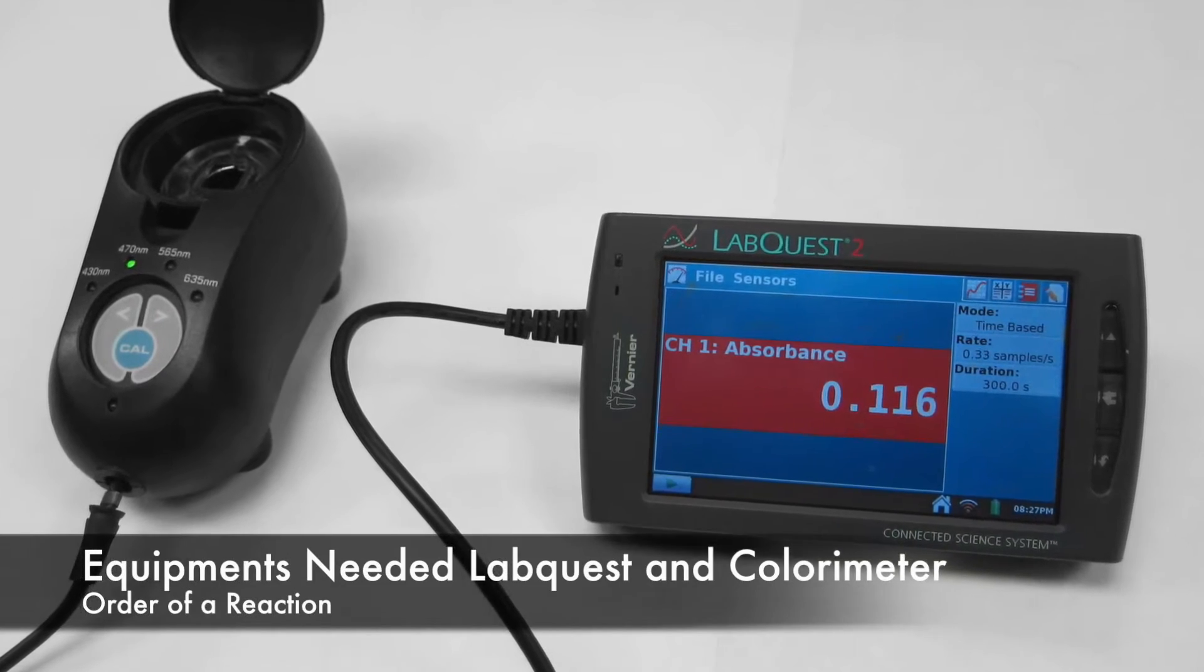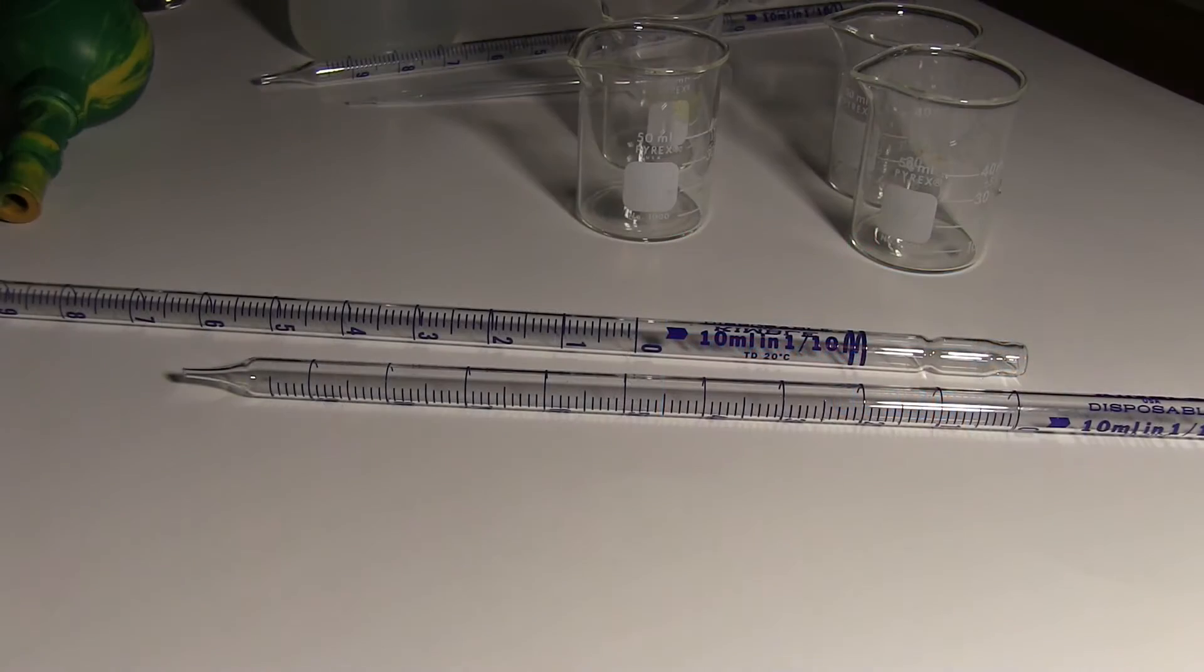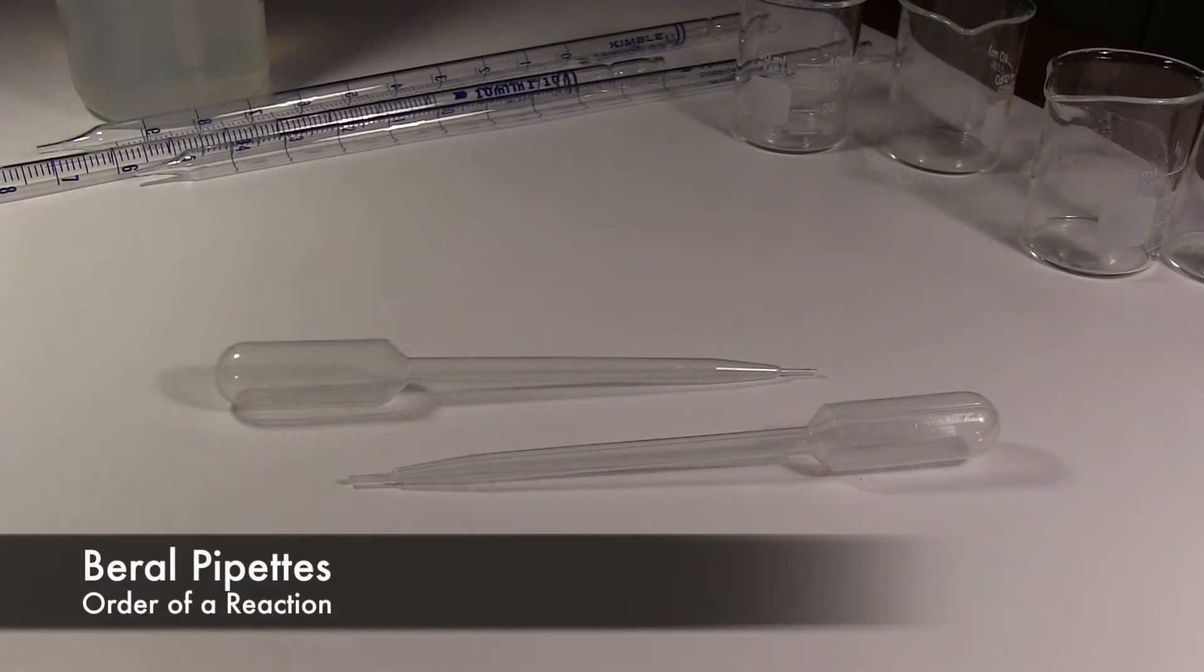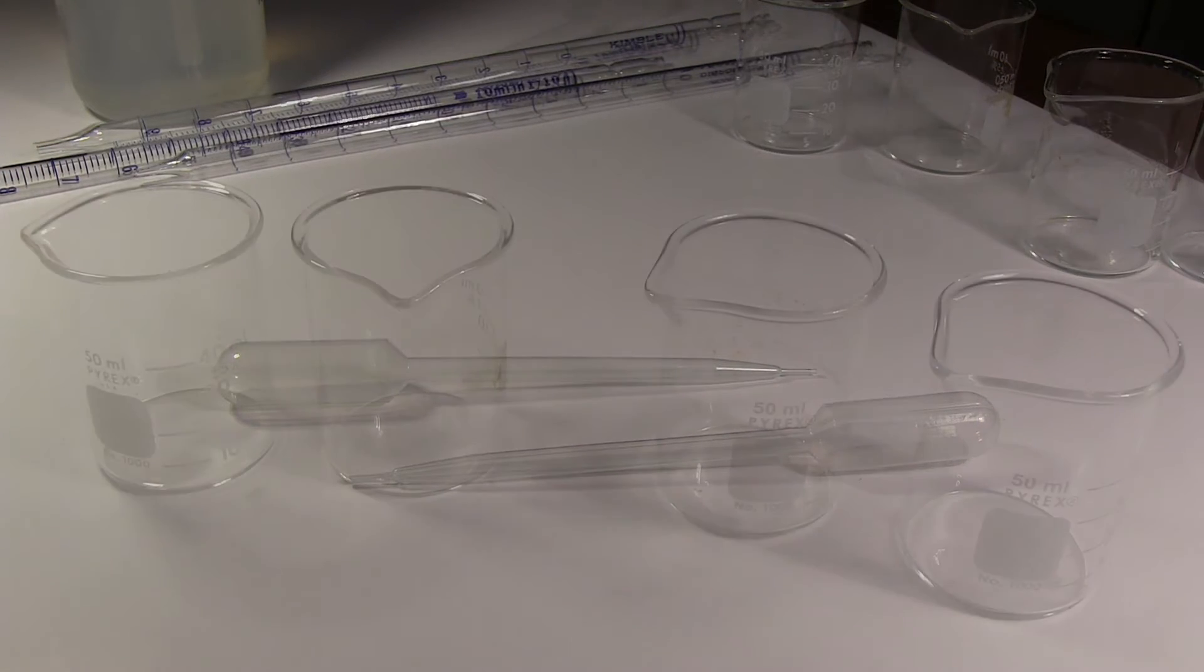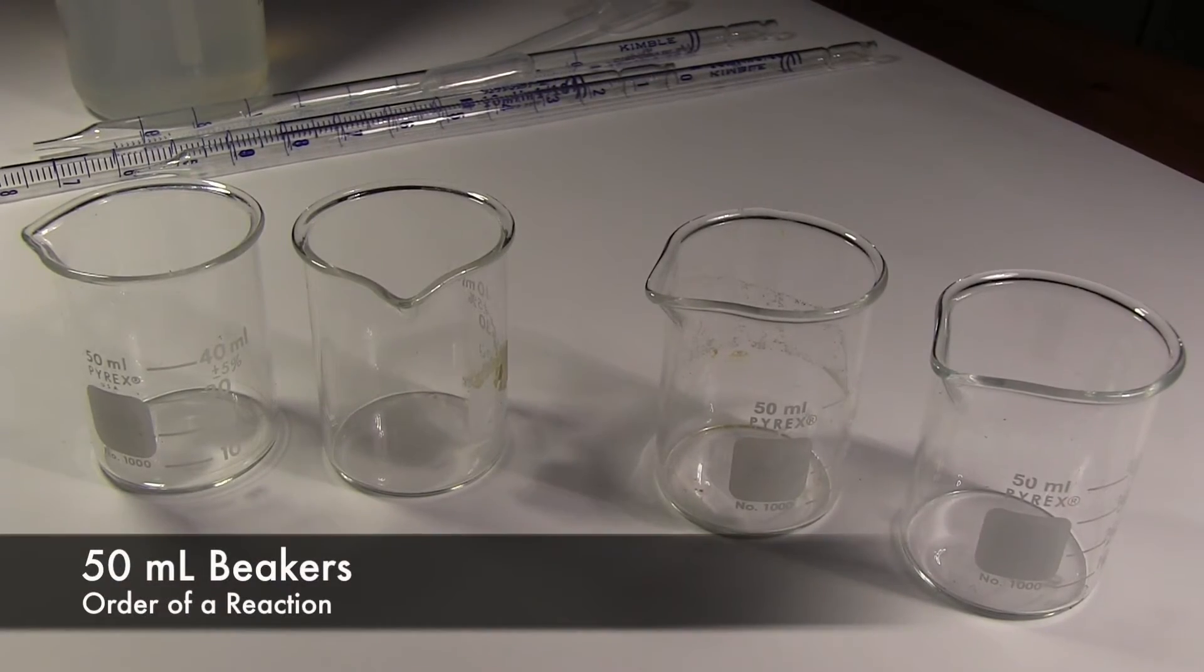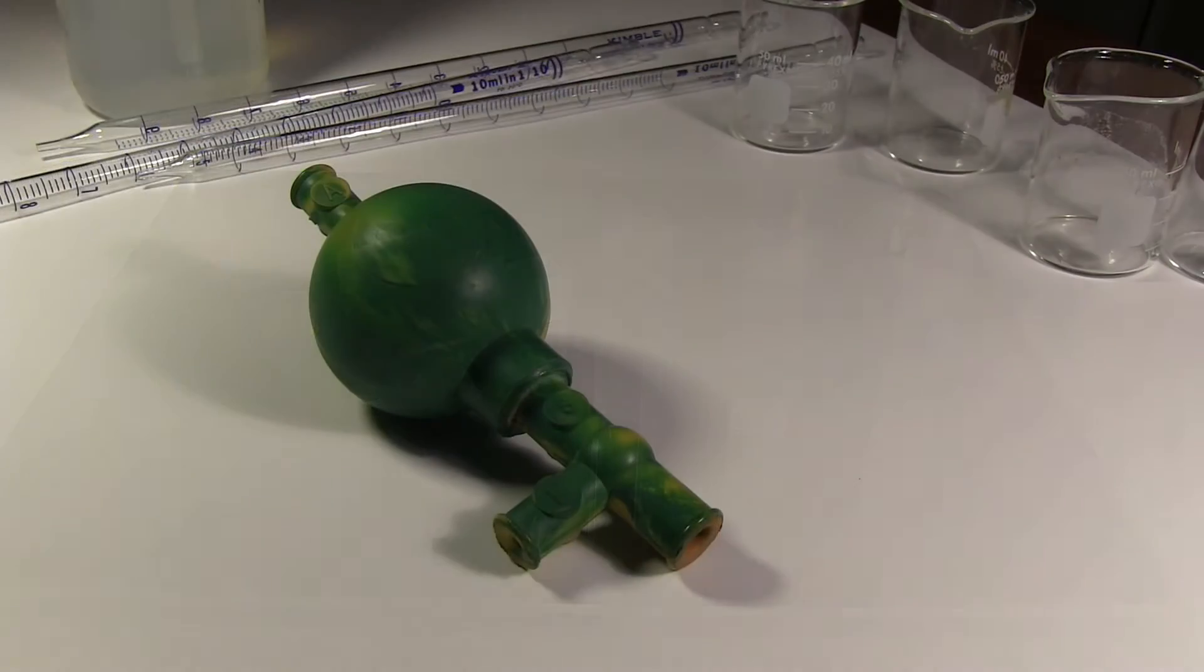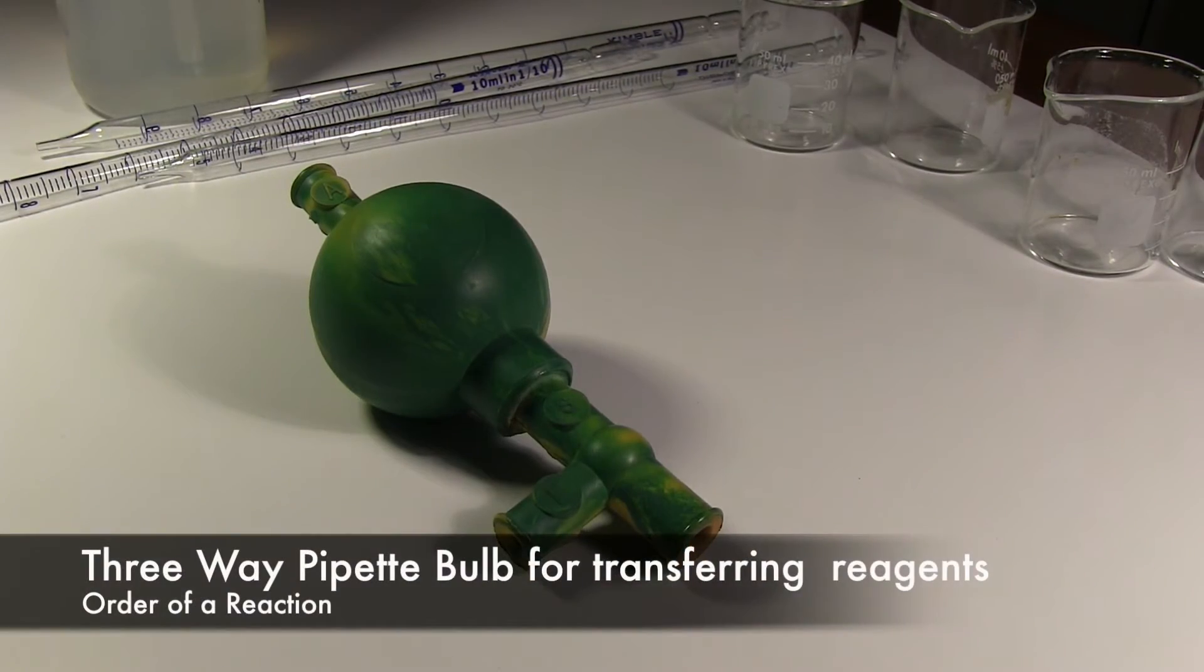Equipment needed are LabQuest and colorimeter from Vernier, graduated dropper pipettes, beryl pipettes, 50 milliliter beakers, cuvette for the colorimeter, and 3-way pipette bulb for measuring and transferring reagents.